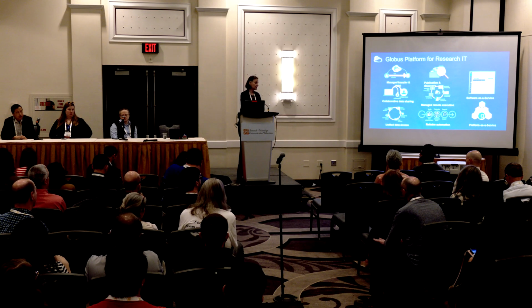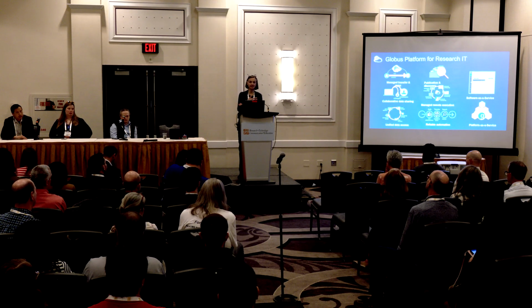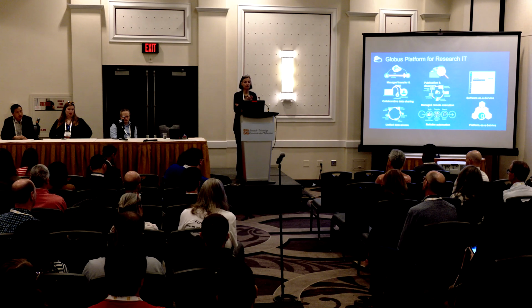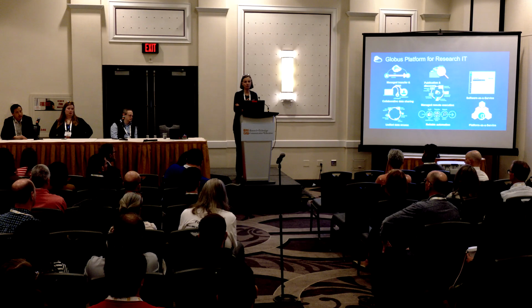And that's because for many cores, research data is what they're producing, it is their product, it's why they're there, it's critical to their success, especially genomics cores I'm thinking of, or imaging cores. So it's very clear why that might be important to those types of cores, but it's also critical to cores where data isn't necessarily the primary product. Maybe it's producing antibodies, maybe it's producing transgenic mice, but the metadata associated with that product is critical for the value of what that core is providing.